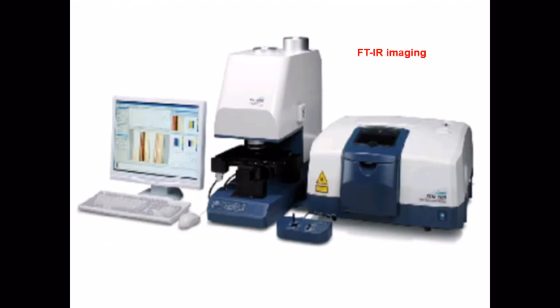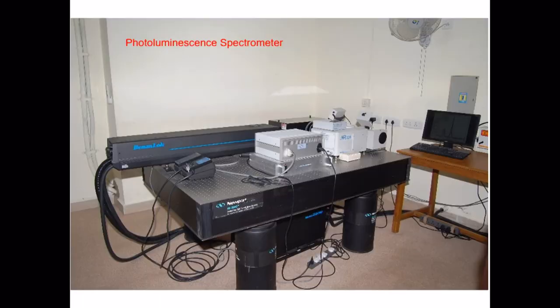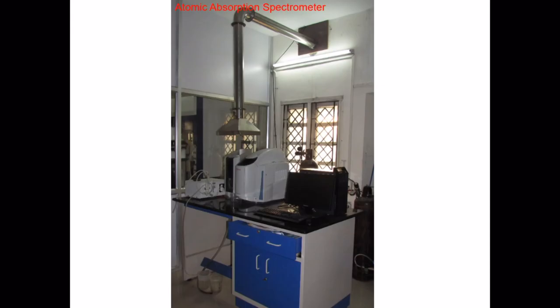Also, we have an FTIR machine. The specialty of the machine is that we can have imaging also. Usually, the functional groups of materials are measured with respect to peaks or absorptions or transmission. But here, we can map it, and in a mapping, you can see the imaging. We have photoluminescence and atomic absorption, wherein you can identify different elements present in the medium through solution.